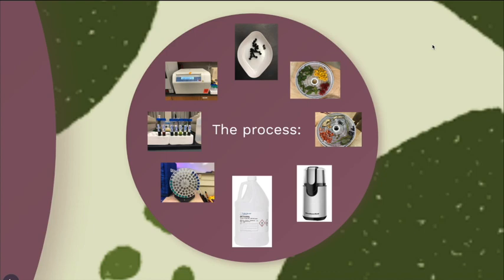After drying, we ground the material in a coffee grinder and weighed out 1 gram of material. We added the ground material to a centrifuge tube and extracted the antioxidants using 10 milliliters of methanol, which is shown at 6 o'clock. The slurries were spun at low speed in a tube rotator for 48 hours. Finally, we spun down the tubes in a centrifuge at 4,000 RPM for 10 minutes to separate the remaining solid materials from the solution. We removed the supernatant for testing and discarded the pellets.